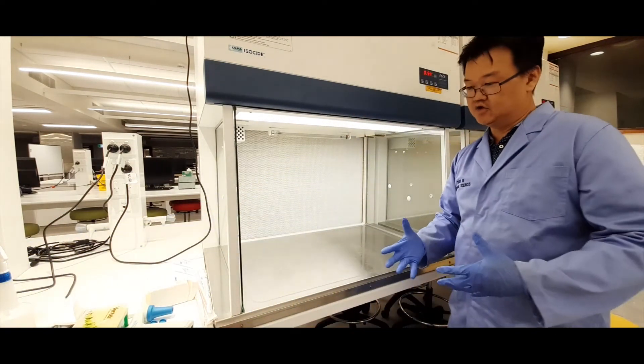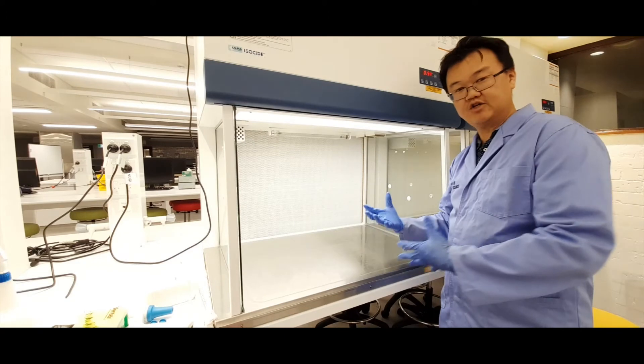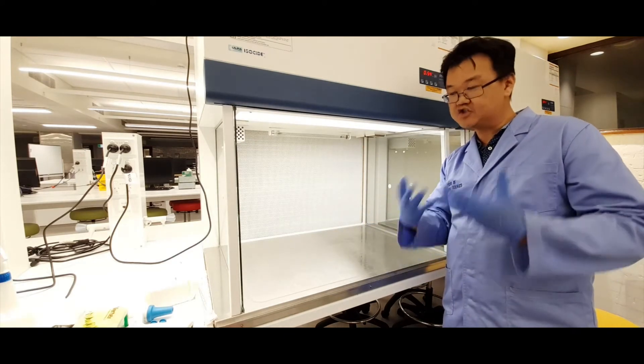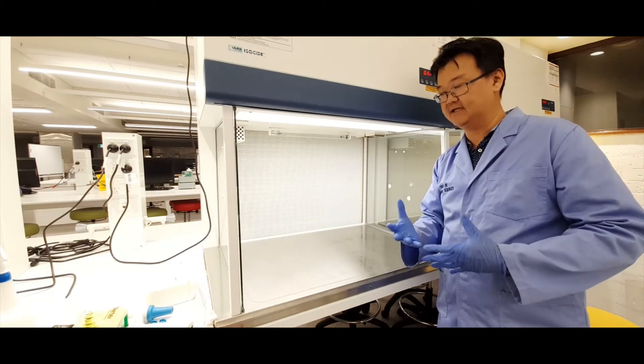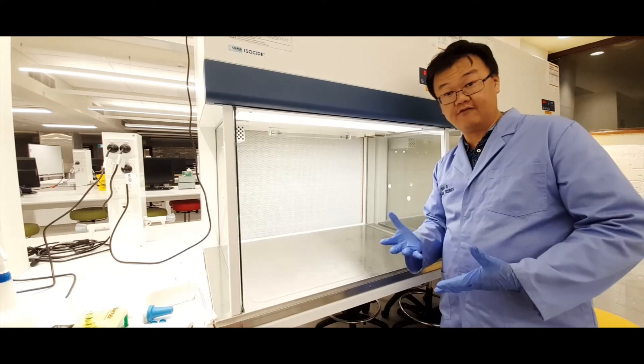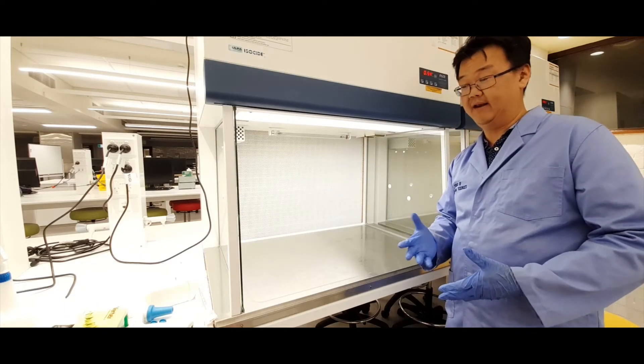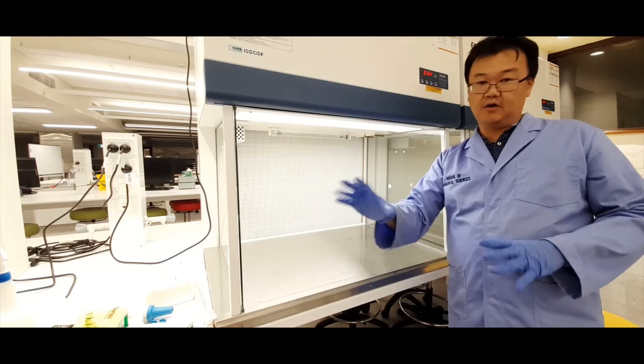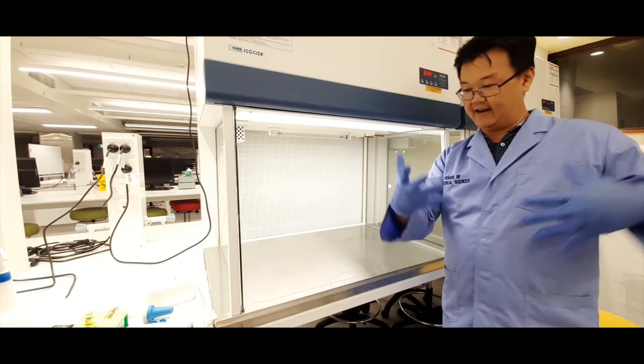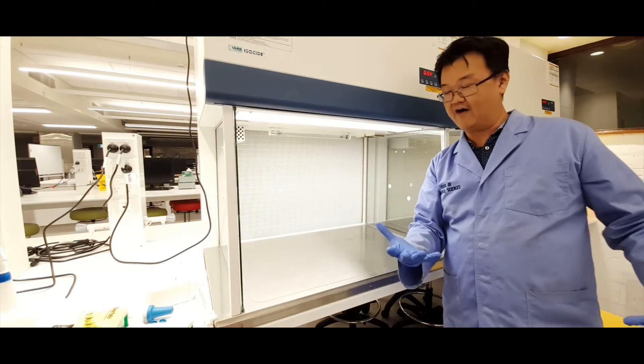And then what you want to do is to bring into the hood any instruments like pipettes or tips that you'll be using for your cell culture experiment. What you want to do is to also spray any items that are coming from outside the hood—that's in a non-sterile environment—you want to spray that with 70% ethanol to clean that before you place them into the hood.